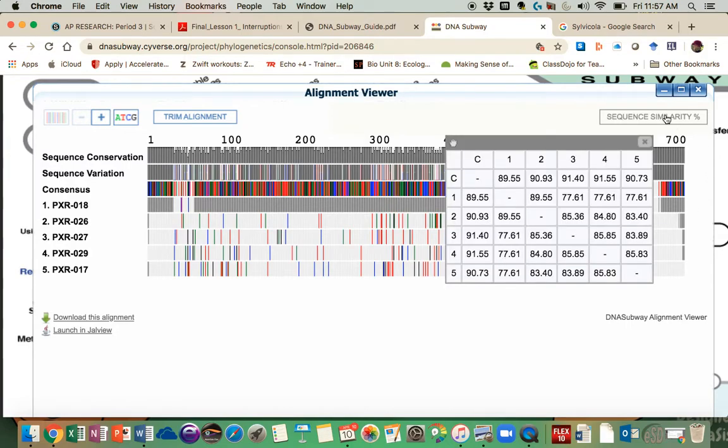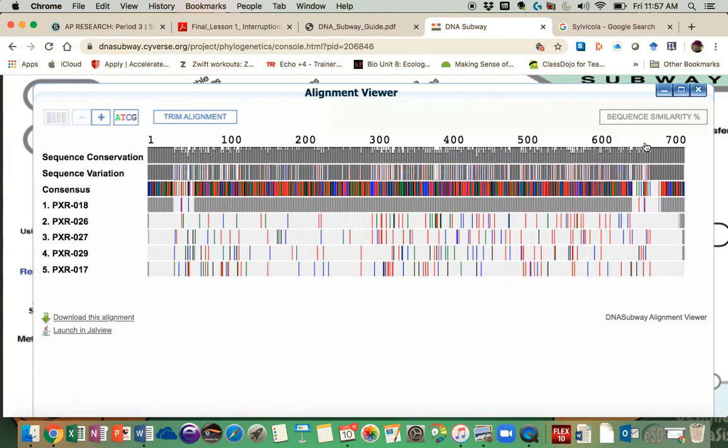You can look at the sequence similarities here as well and include those as separate figures. I think that would be a great thing to do. I do believe Emma set her paper up that way, and perhaps Ethan as well. I'm not exactly sure. So take a look at those. Let me know if you have any questions.